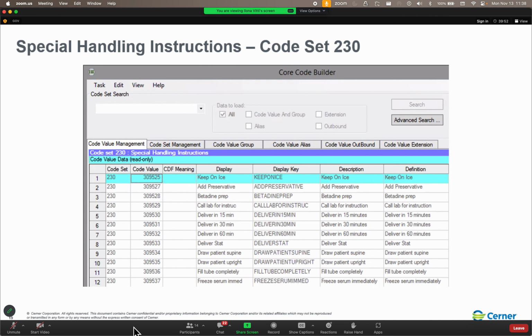And the third gotcha, if you decide you really do want to go ahead and customize those labels, the customized label programs cannot be supported by Oracle Health Server because we don't have your code installed in our in-house domains to be able to take it apart and put it back together again.